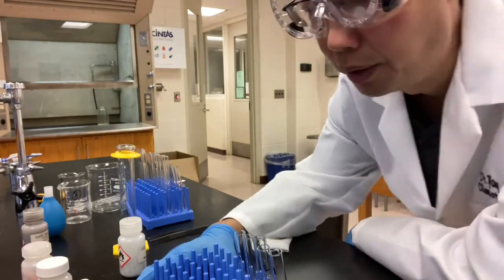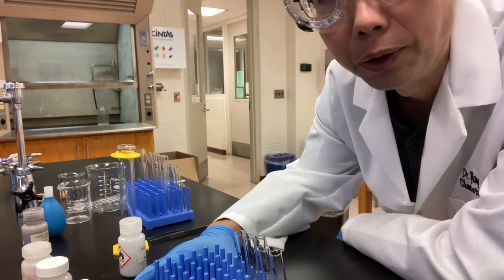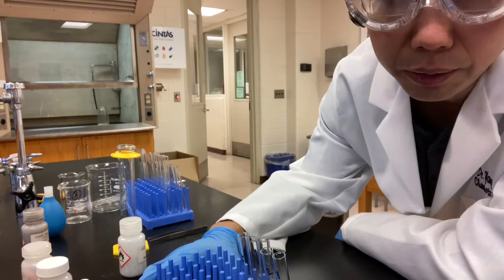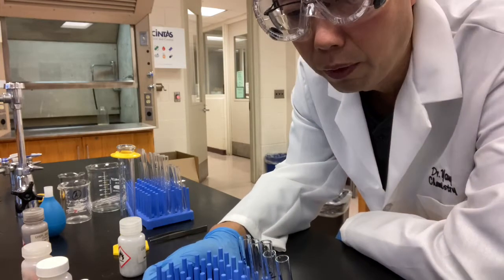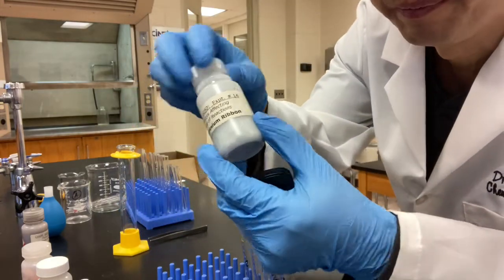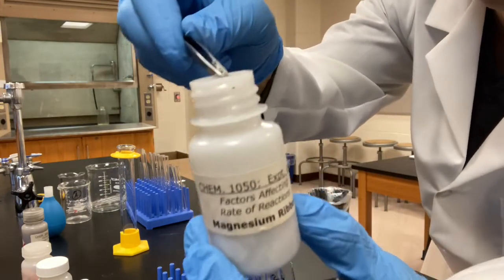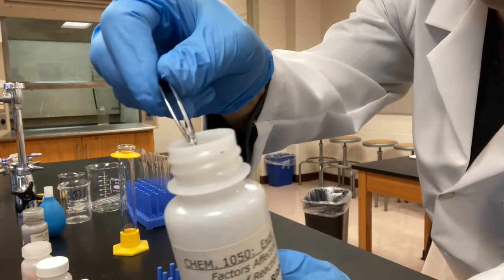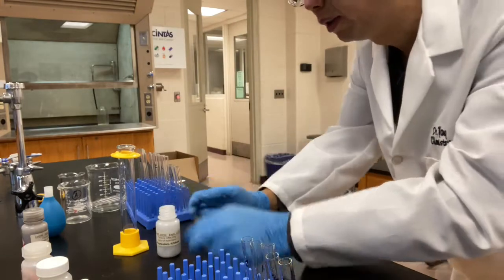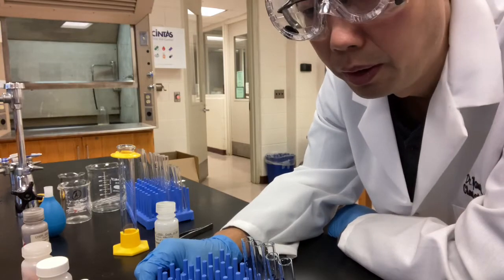All right, now this is the first part of this experiment, nature of the reactants. And there are 2 sections that talk about nature of reactants. The first one, we're going to use magnesium strips, pieces of magnesium strips, to react with 5 different acids.